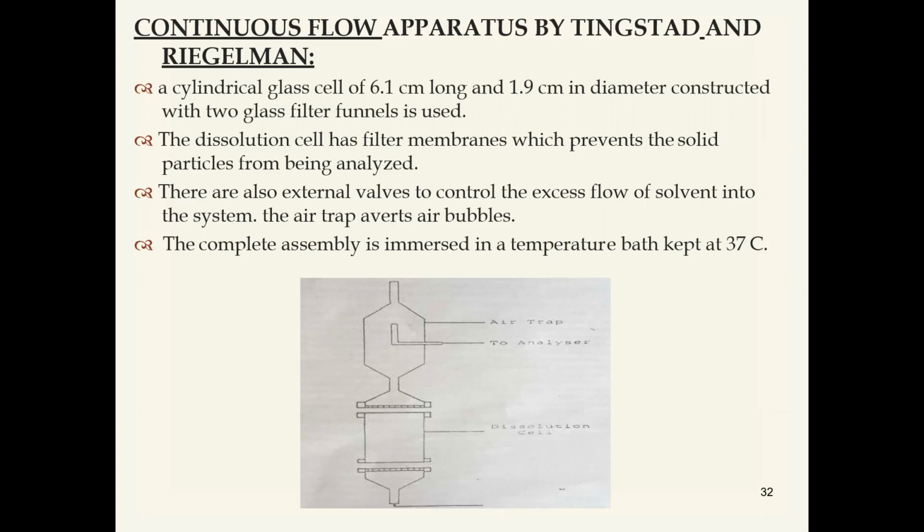This is constructed with two small volume glass filters. So these are the filters. Two small volume glass filter funnels are used.